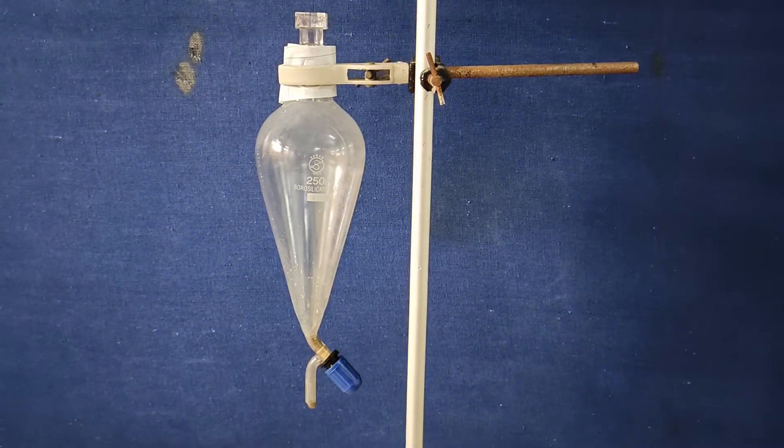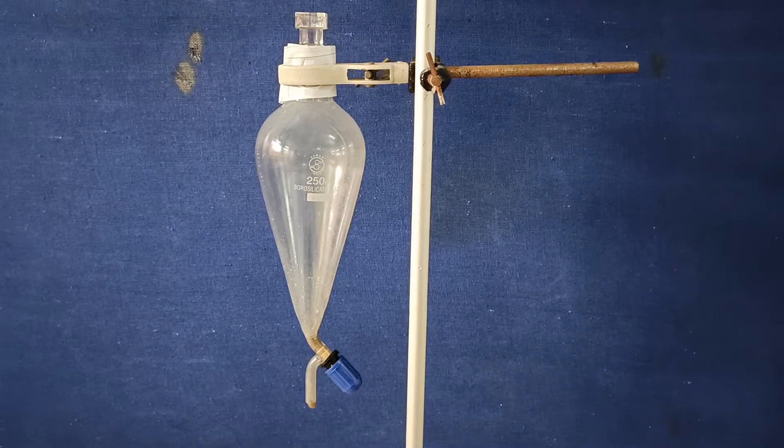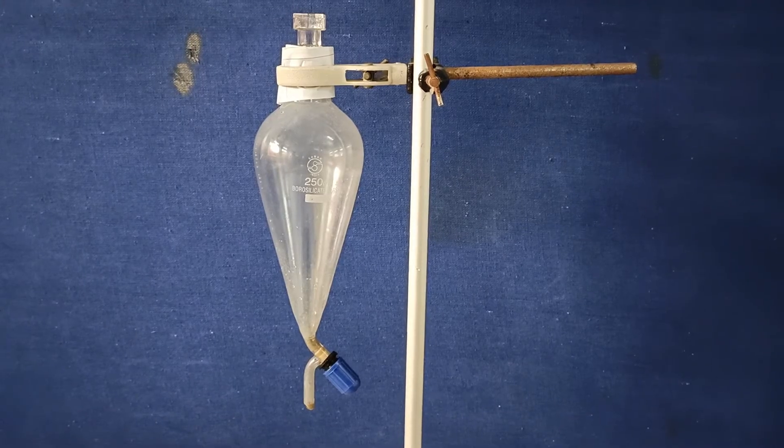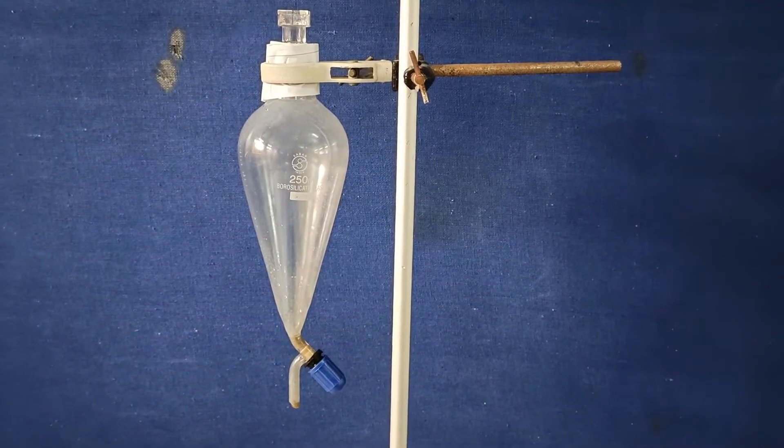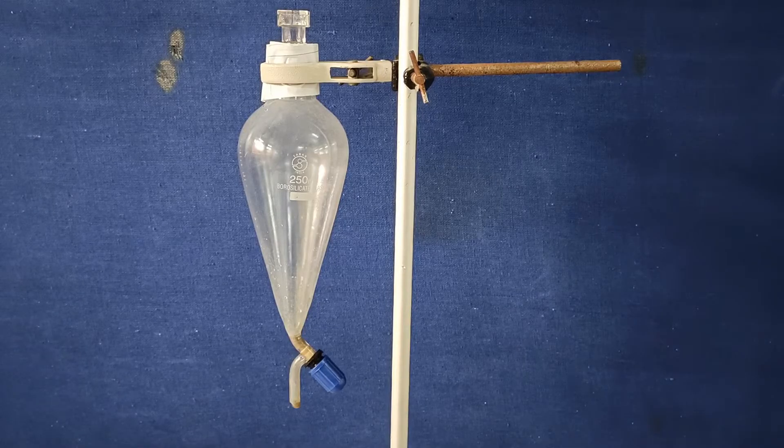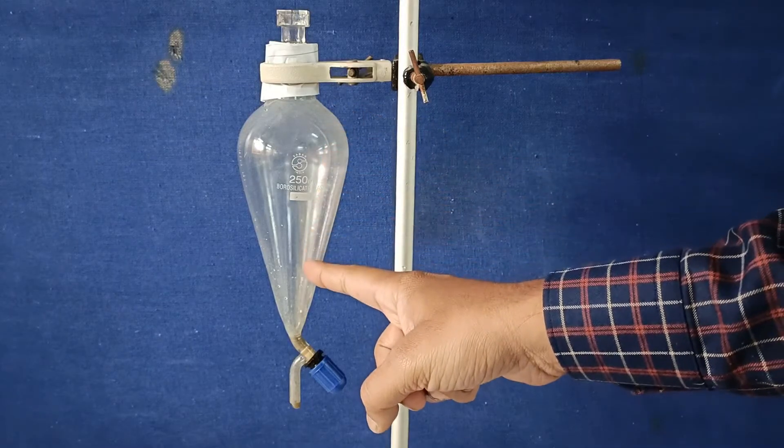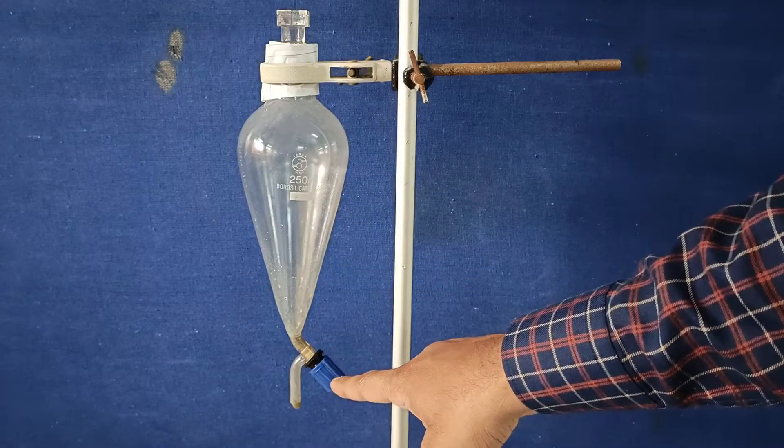Hello everyone, welcome to Make Me Scientific. A separating funnel is an apparatus made out of glass used to separate two immiscible liquids. The principle is the difference in densities of both the liquids. This is the stopcock with which the flow of liquid coming out can be controlled.